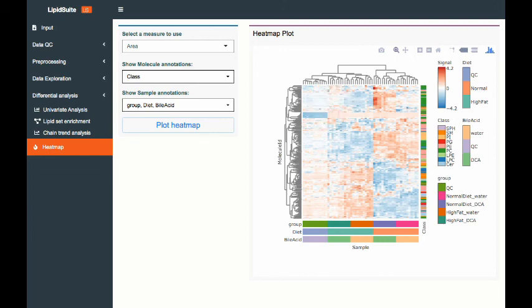And then here there's the molecule, and when you hover over that, it will show you what molecule and what is the log2 area of that as well. You can see here which lipids are clustered together. You can see here a few PCs clustered together. You can see here as well, these are the PCPs and PCOs, the plasmalogens. So overall, you can export this as well as an image by clicking, I think, on the camera here.